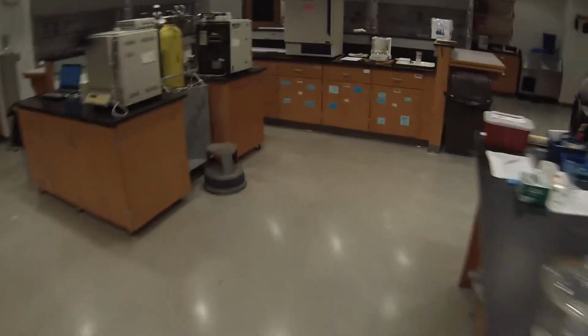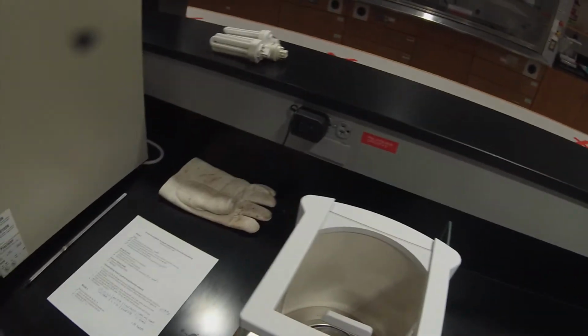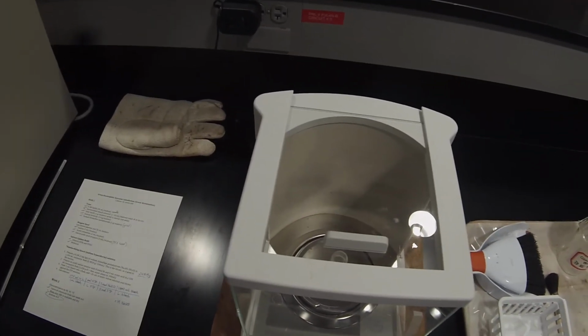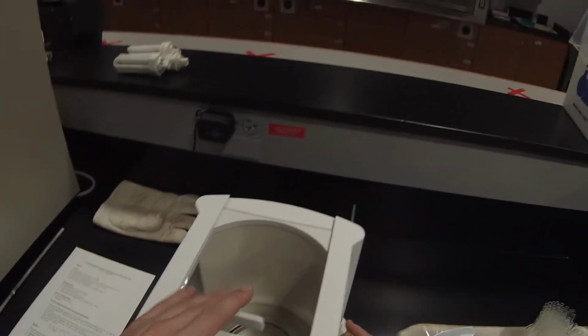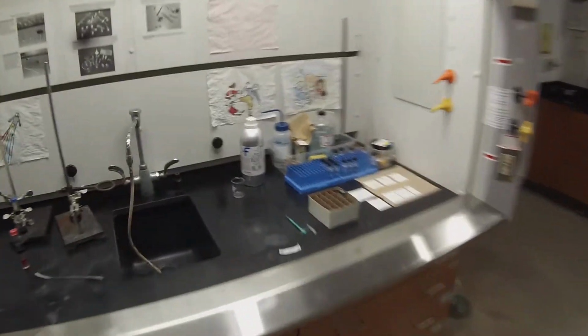So we can go get a mass. It's a little less than 1 milliliter. Those readings are not that accurate. So we're now at 19.895 grams. 19.895. And we will cap that up and put the label on it.